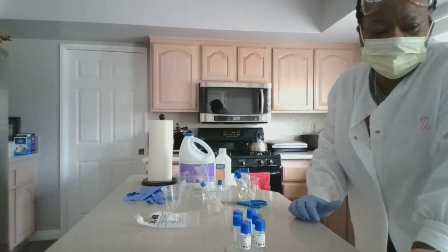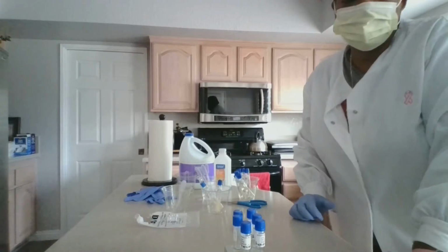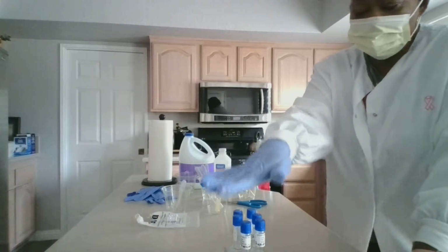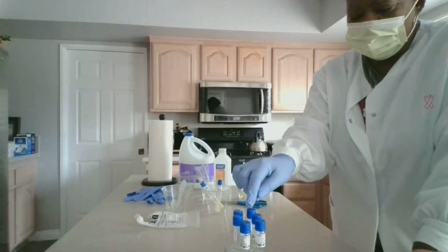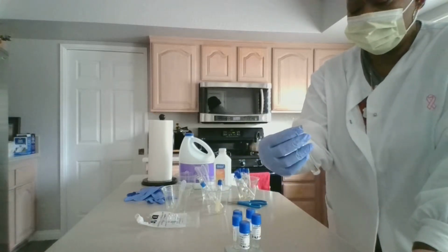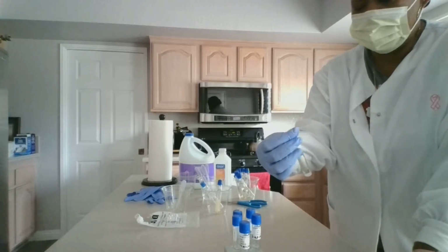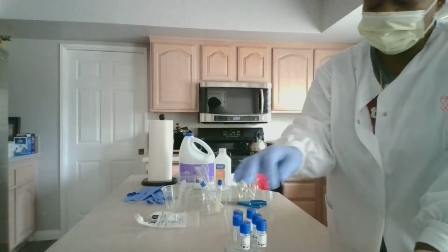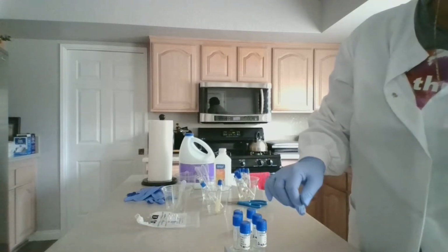And the exercise today is for the salt tolerance test and the salt tolerance pH test. So I have all my setup here. I have my 1%, 7%, and 15% nutrient broth with the NaCl. This is the 1%, and like I said, the 7 and the 15.